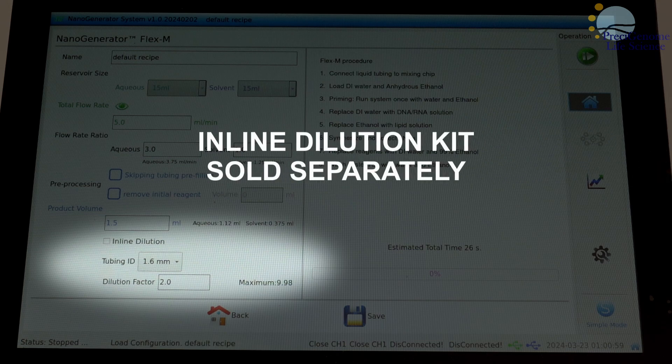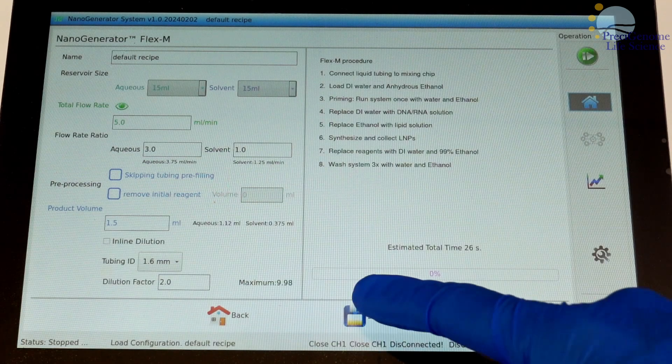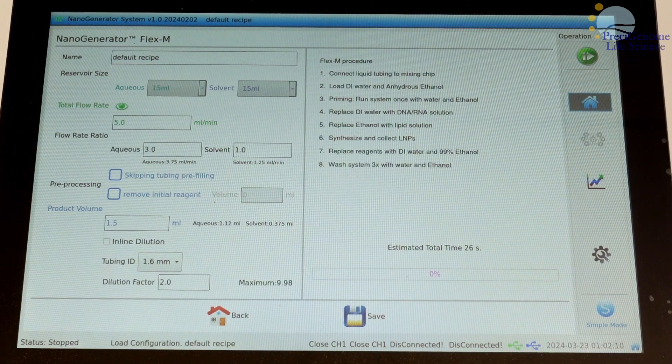The inline dilution option requires an add-on kit, which is sold separately from the FlexM. Two options are available for pre-processing: users may skip pre-filling the liquid tubing if reusing the same formulation, or remove an initial aliquot to improve product uniformity. When you are done setting your parameters, simply save the recipe and it is ready to go.